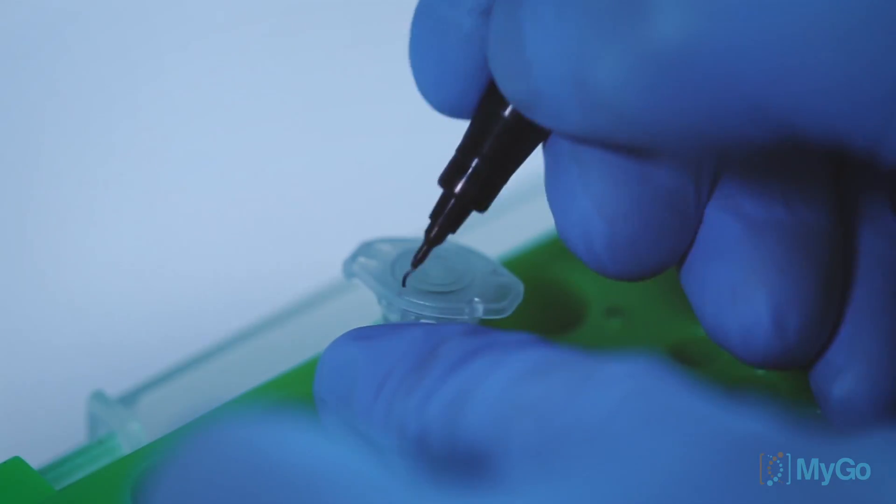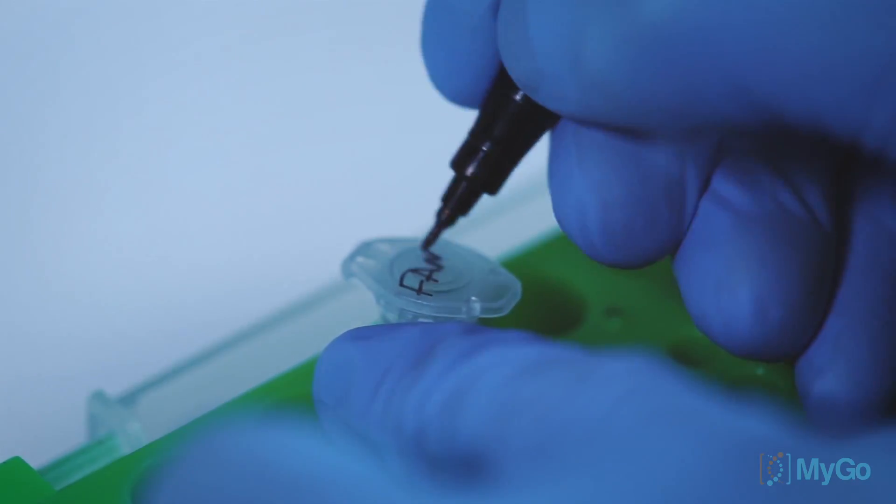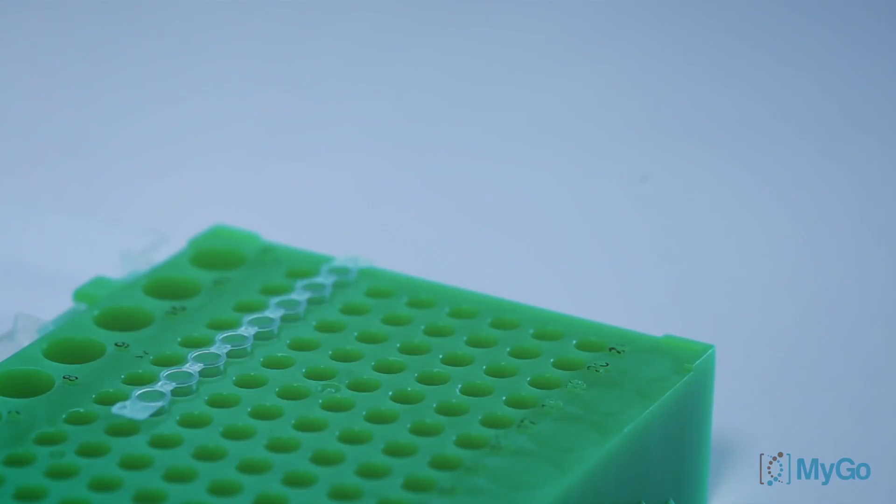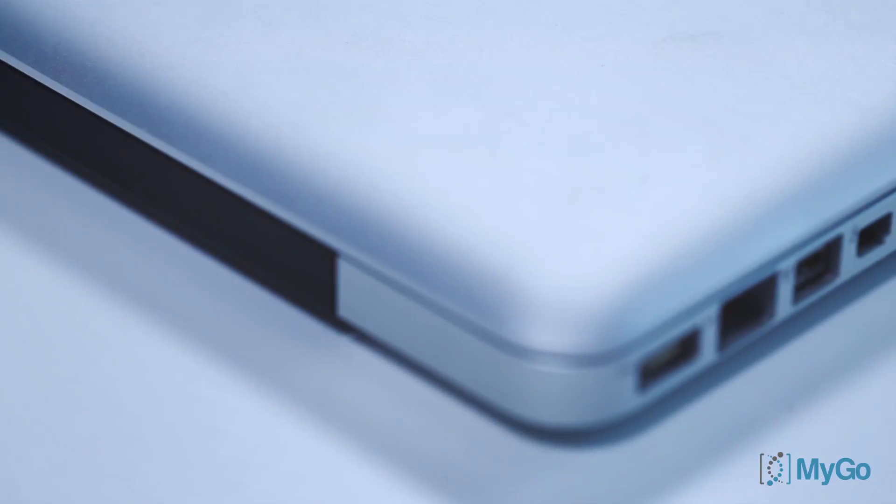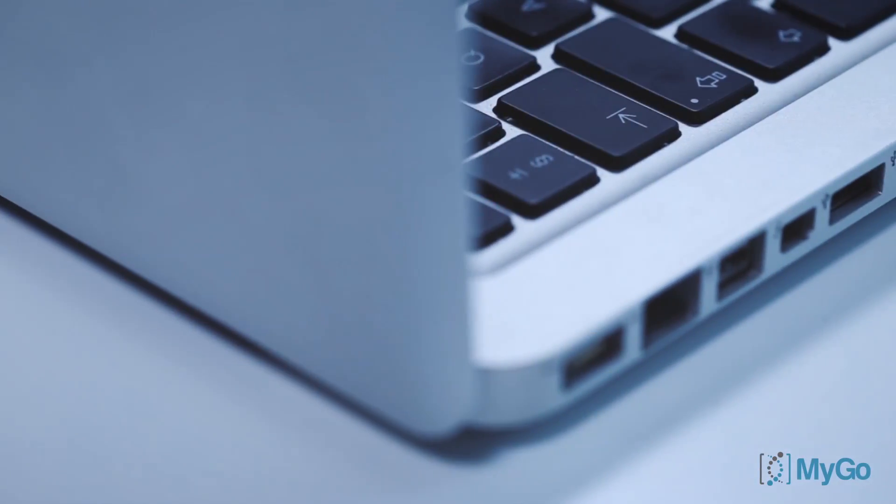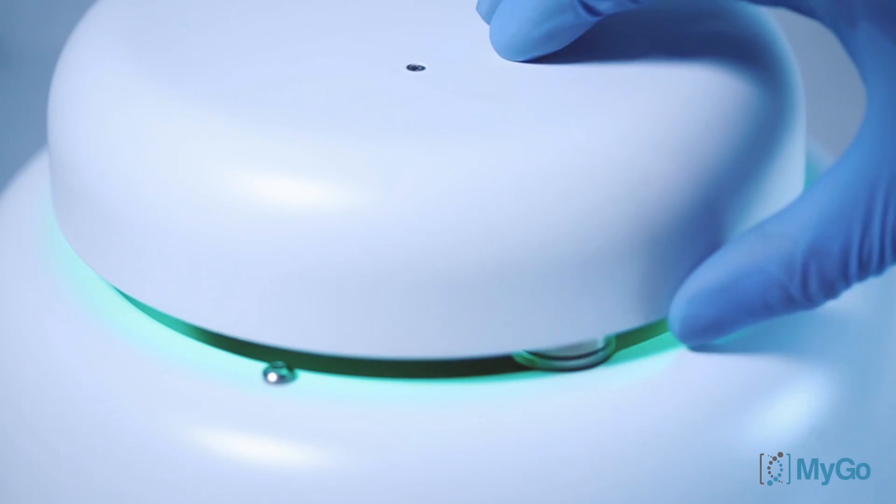You'll also need a pen to label your tubes. You should use MYGO Pro 8-well strips and caps. A vortex will also be useful when mixing, but is not essential. Finally, you'll need a laptop or PC and a MYGO Pro to run your experiment.